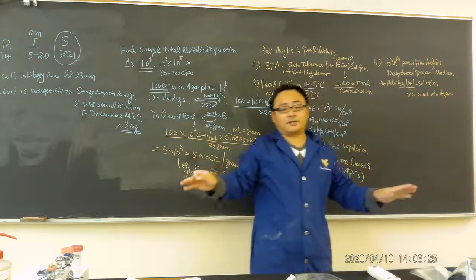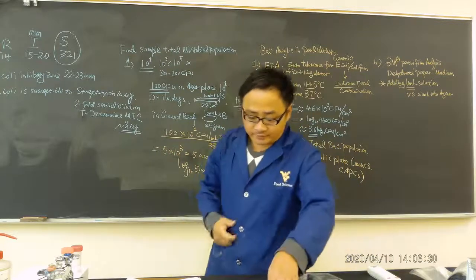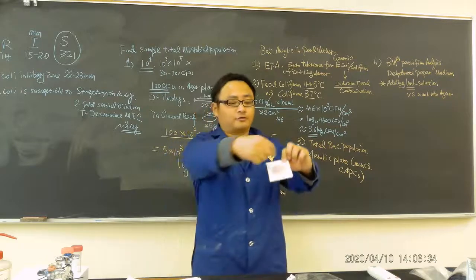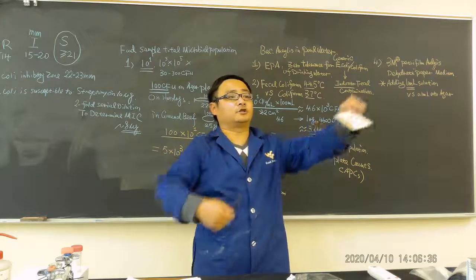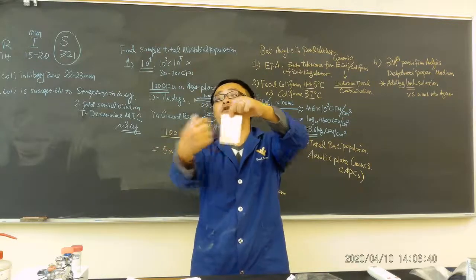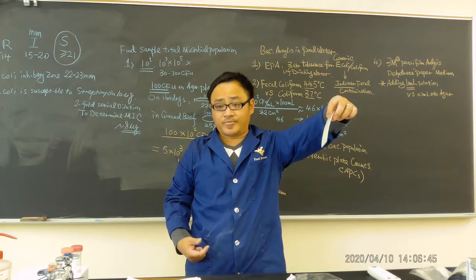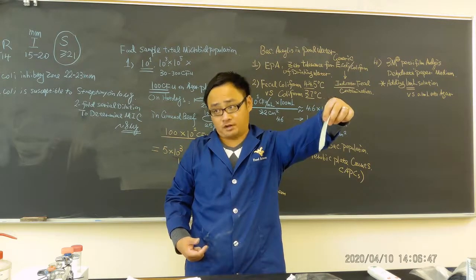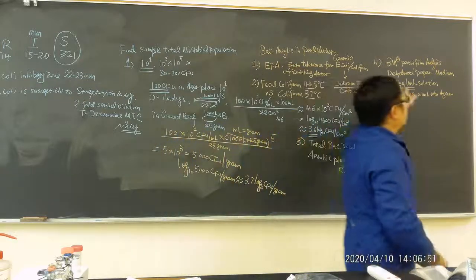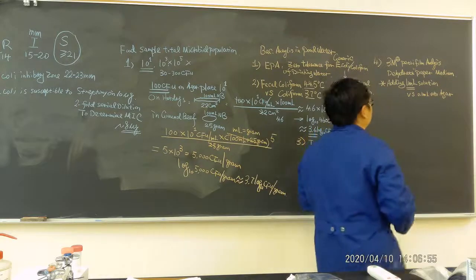Since this is the last lab, we want to check whether you did it well. Lots of the time, let's say we meet on Tuesday again, some of you will get a tiny corner in the plate, and some of you get a large spread of liquid. When I see it, I will say that person did not do well, because you only added 0.1 ml onto the paper media. You should add 1 ml solution here, because that area can fit 1 ml solution.